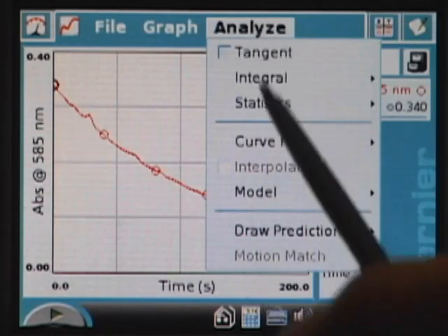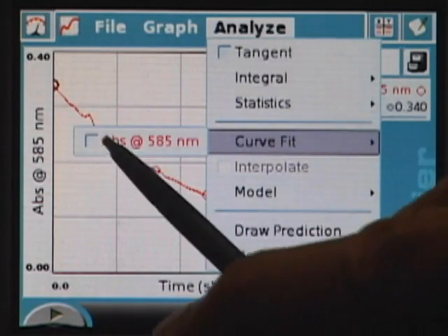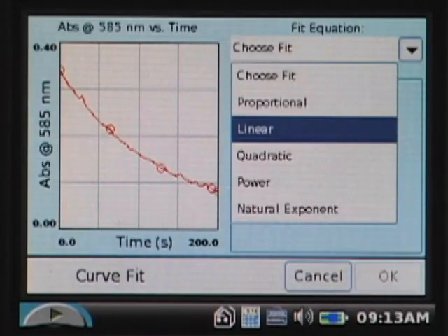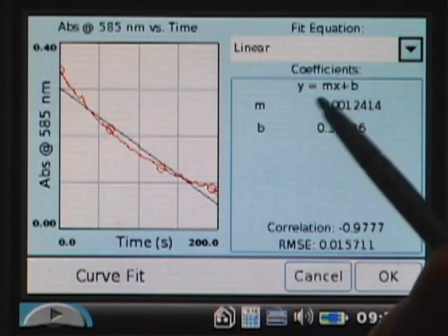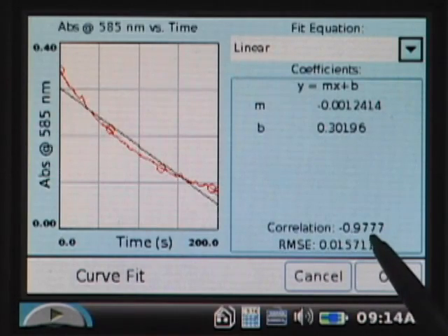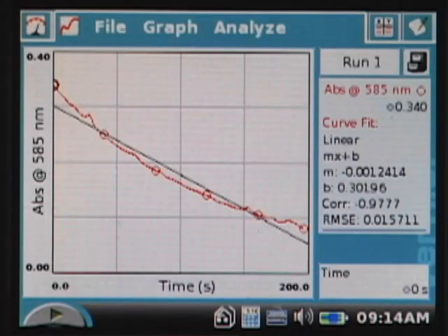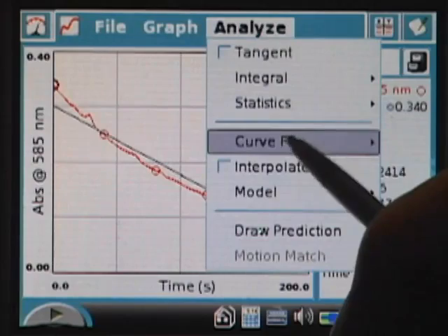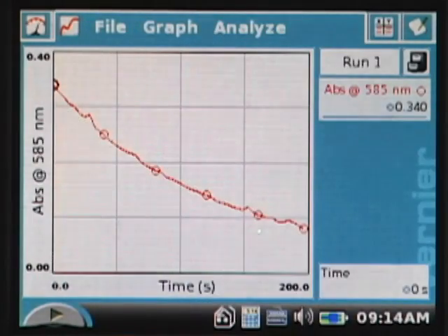For comparison purposes, I tap the Analyze menu, go to Curve Fit, and choose a linear fit on absorbance. The linear fit gives y = mx + b, and the correlation coefficient is −0.9777, so it's not really all that linear — our eyes told us that but now the statistics confirm it. I note that value for comparison, then tap Analyze again, choose Curve Fit, and uncheck it to remove the fit from the graph.